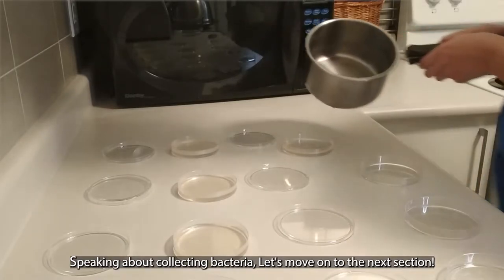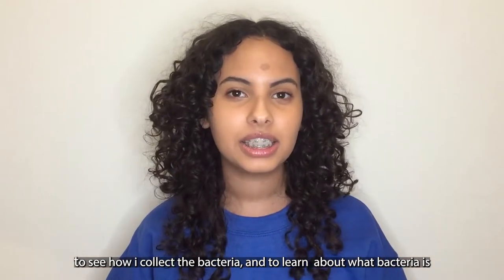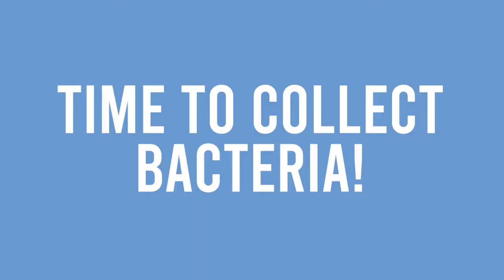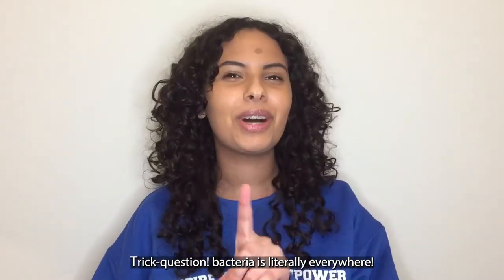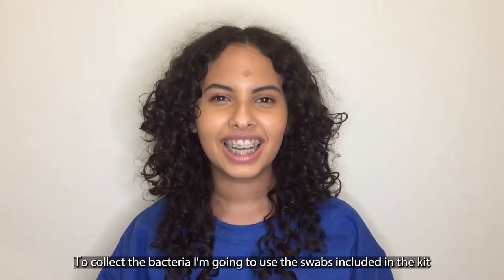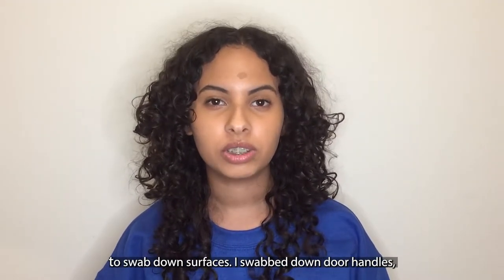Speaking about collecting bacteria, let's move on to the next section to see how I collected the bacteria and to learn more about what bacteria is. For this portion, we're going to have to collect the bacteria. But where are we going to get it from? Trick question — bacteria is literally everywhere. To collect the bacteria, I'm going to use the swabs included in the kit to swab down surfaces.